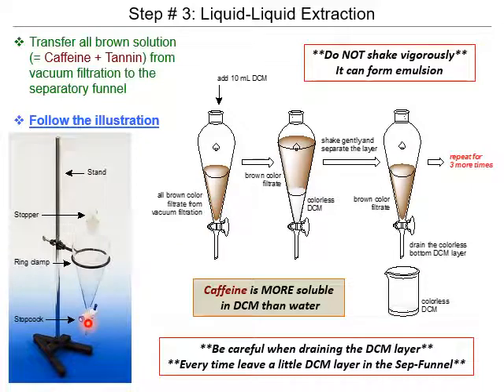Before you do that, though, you make sure that this stopcock, this lever, is set on the horizontal position or the vertical, depending on the separatory funnel, so that it doesn't come out, right? Even before you pour it in, you want to have a beaker like this, so that even if it's broken, or if you forget, you don't spill your product and mess it up, right?